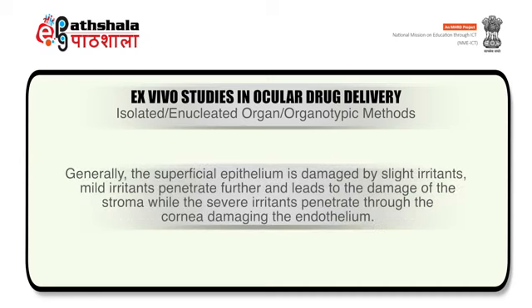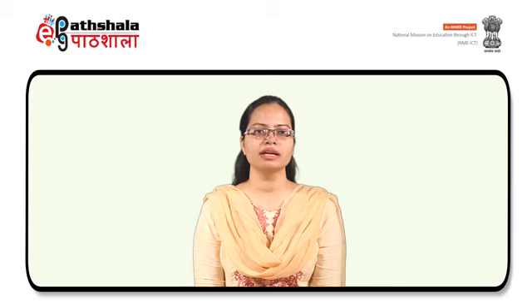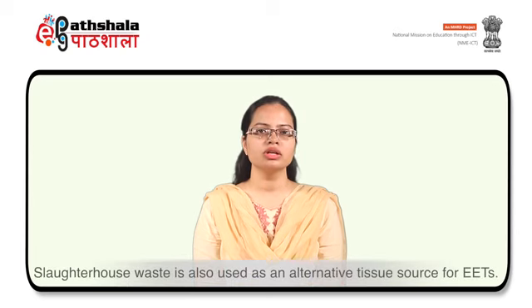Generally, the superficial epithelium is damaged by slight irritants. Mild irritants penetrate further and lead to damage of the stroma, while the severe irritants penetrate through the cornea, damaging the endothelium. Ocular organotypic models or enucleated eye tests were first carried out using isolated rabbit eyes from animals used for other research purposes or those sacrificed commercially as a food source. Slaughterhouse waste is also used as an alternative tissue source for EETs.